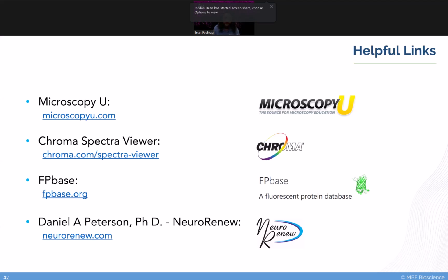Chroma is a company that makes filters and filter cubes and dichroic mirrors, and we tend to use a lot of them with our systems. They have a fantastic tool called the SpectraViewer that allows you to actually dive in and see how the different spectra of excitation and emission are going to interact between your filters and your fluorophores.